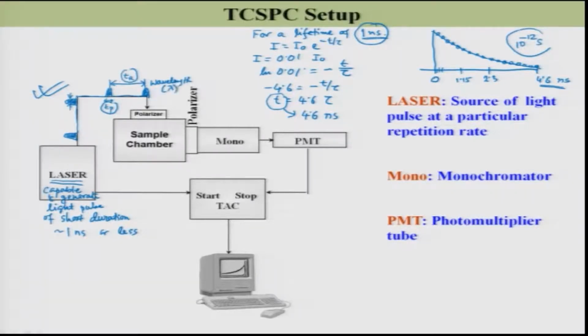So, for a laser, I will fix: what is the color of the laser? What is the pulse width? And what is the repetition rate of the laser?